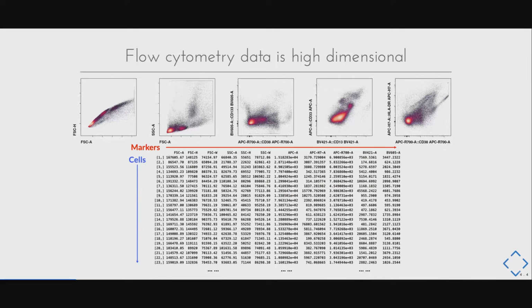So when we analyze flow cytometry data manually, we mainly deal with 2D scatter plots, like I showed here. Have you ever wondered where these plots come from? So these 2D plots are derived from a matrix like the one I showed here. Each row represents a data point, usually a cell, and each column records the signal intensity of a fluorescence marker, determining the event's position on the corresponding axis. So the 2D plots are based on a pair of selected features or columns.